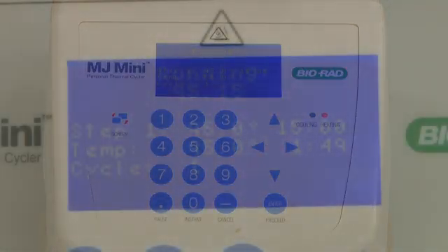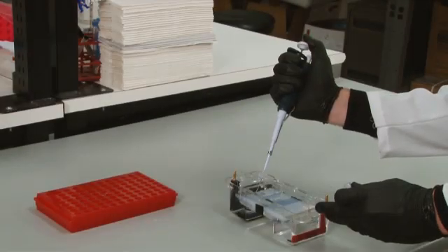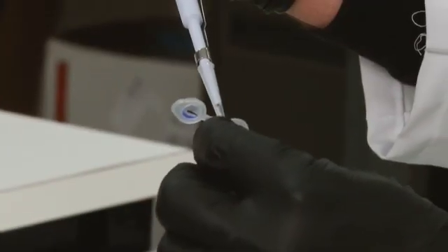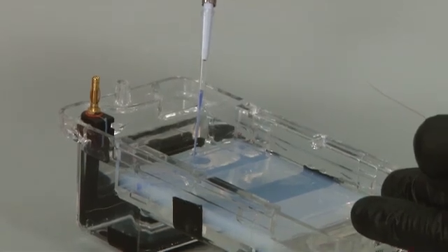Incubate at 95 degrees Celsius for 15 minutes. Finally, run 10 microliters of the diluted sample with loading buffer and DNA binding dye alongside a 100 base pair ladder to verify fragment size.